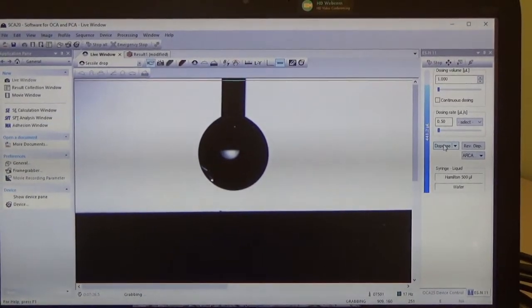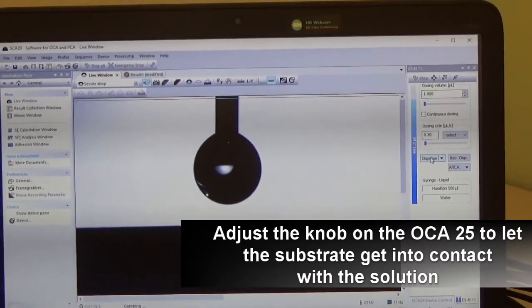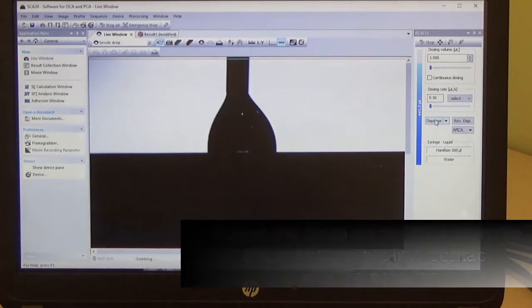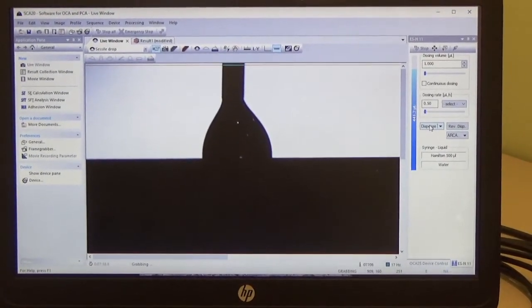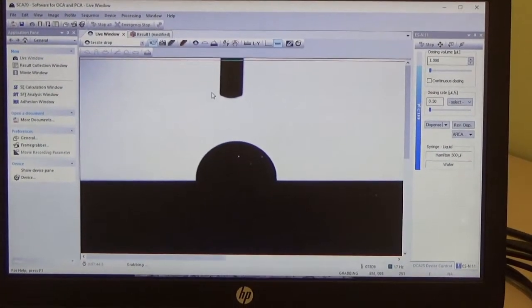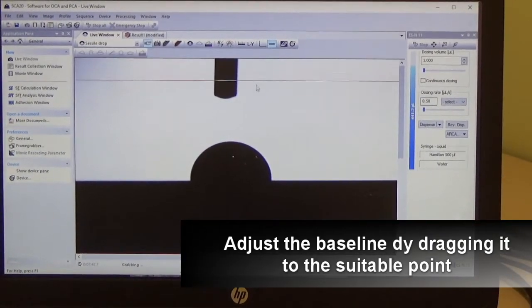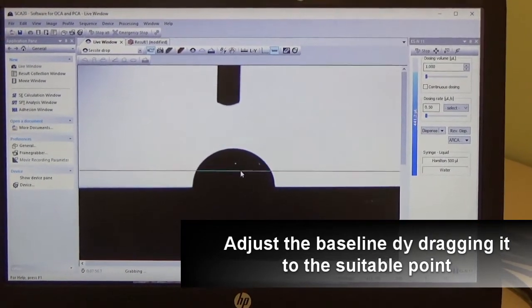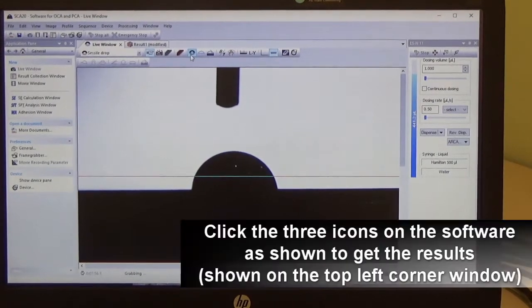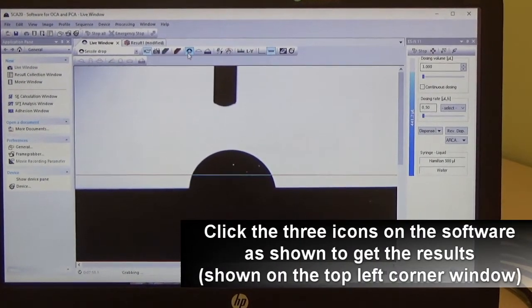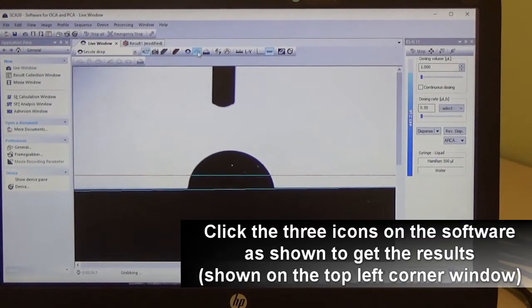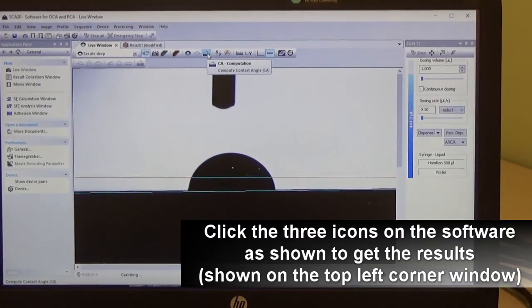Once dispensing is done, adjust the knob to let the substrate touch the water droplet, then lower down the stage. Next, adjust the baseline and click the baseline correction, then perform the profile contour and finally the computation.